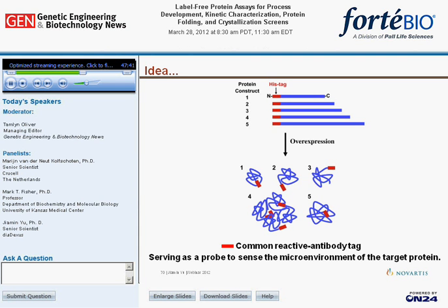Assuming these are the conformations of the soluble expression upon expression, then you would want to avoid construct number 4 because of aggregation, and construct number 5 because the tag is hidden and would not be available for purification. Construct 3 and 2 are favorable, and not sure about construct 1, probably not ideal.